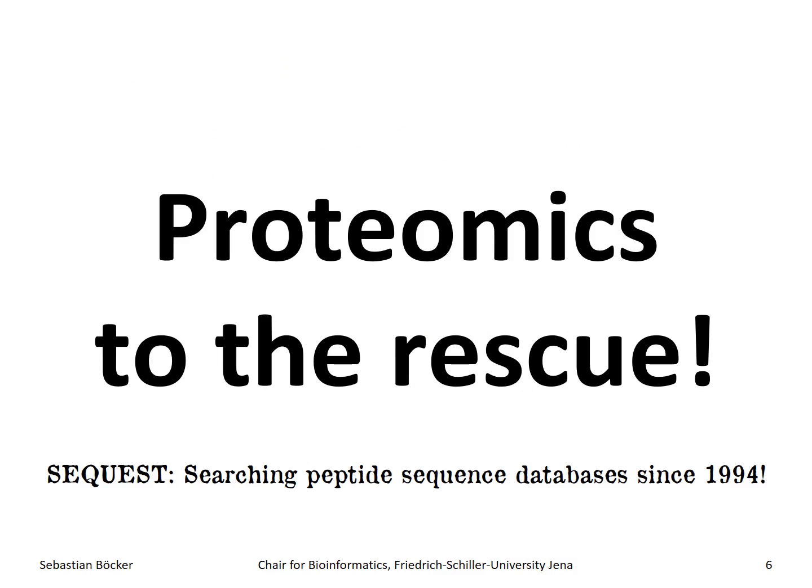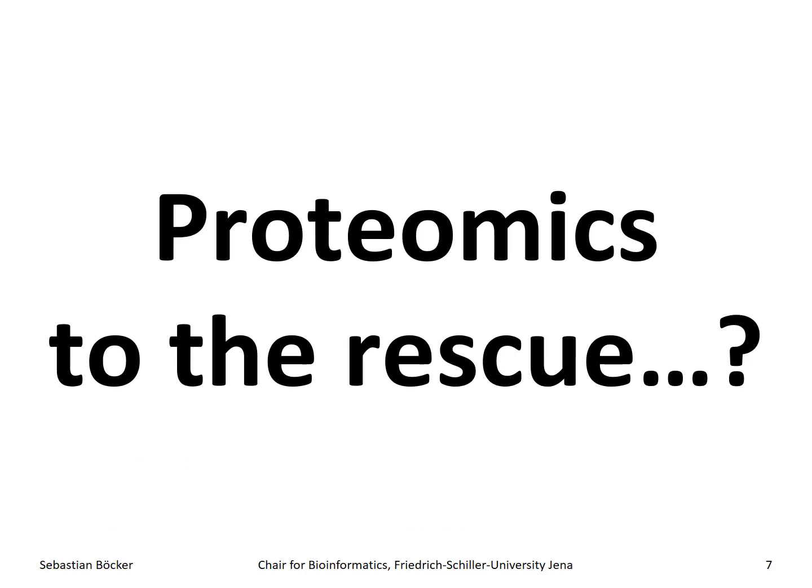And another field that is somewhat related to small molecule annotation via tandem mass spectrometry is obviously shotgun proteomics. So there was always the hope that we could reuse methods from shotgun proteomics for peptide identification also in the field of small molecule research. After all, they have been searching structure databases for more than 25 years, and they are highly successful with doing so. But I don't think this is going to happen.